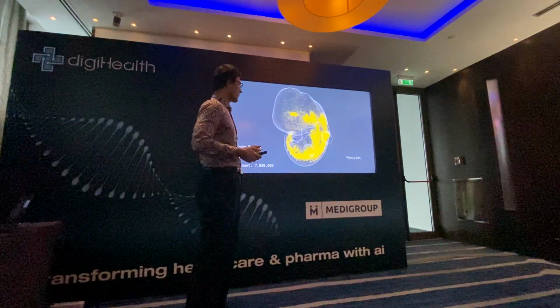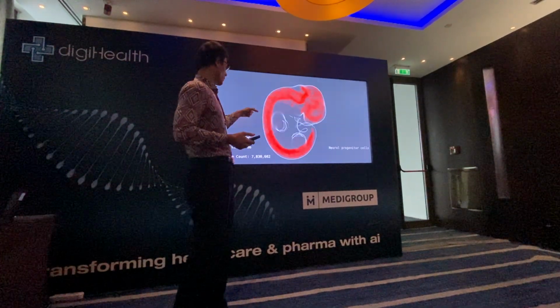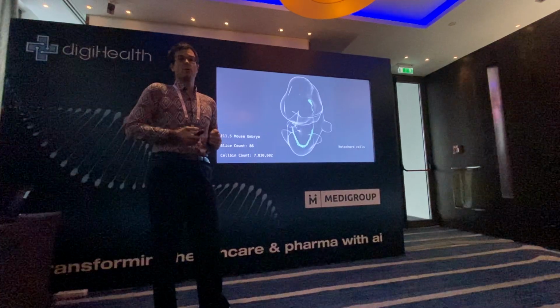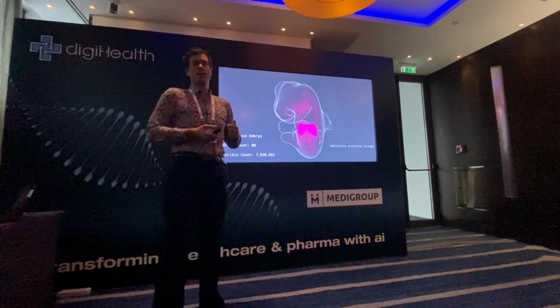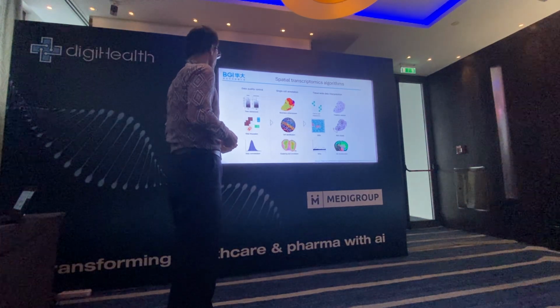Here you can see a 3D reconstruction representation of the entire organism with the different cell types present in it. It represents a valuable source of information and insight to the scientists about the functioning of the organism and the interaction inside of its cells.